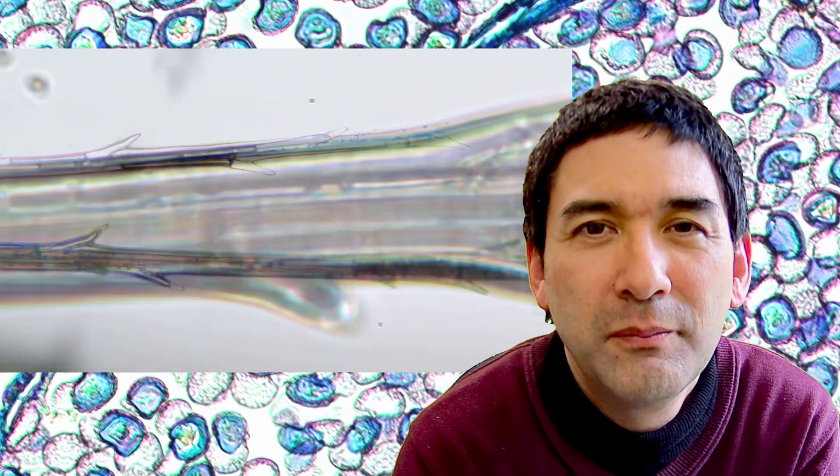This was a picture where I used digital zooming to get some motion into the whole thing. Here it's a bit too bright—a little overexposed. But you can see some of the air inside the structure as well.